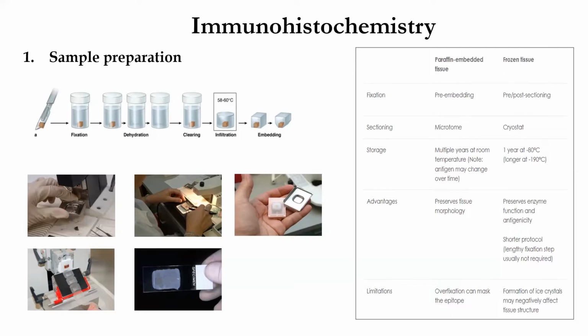This buffered formalin helps to maintain the tissue integrity, so the nucleus, cytoplasm, everything is intact inside the cell. Then this tissue is dehydrated in alcohol. This is just a protocol. The important thing is it is then embedded in a paraffin block. We all know what paraffin is. In the histology departments of ACTREC and TMH, this procedure takes place where the tissue is fixed in a paraffin block. It is fixed in a steel cassette in which the paraffin is poured. Then you place the tissue of your interest in that paraffin, and after solidification, you get this kind of a block.